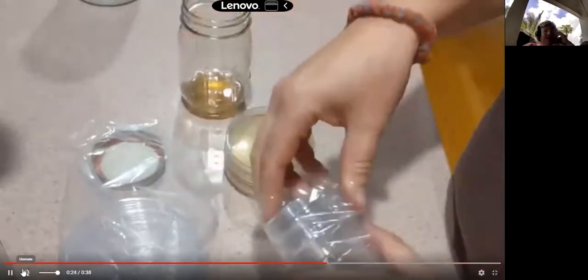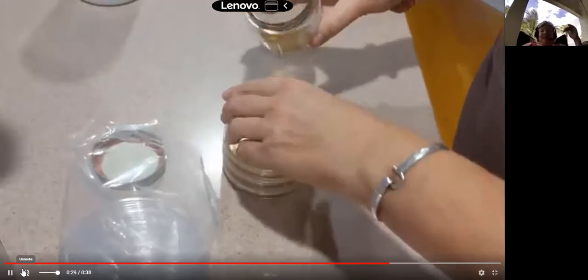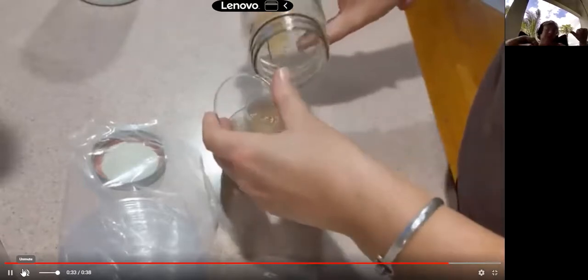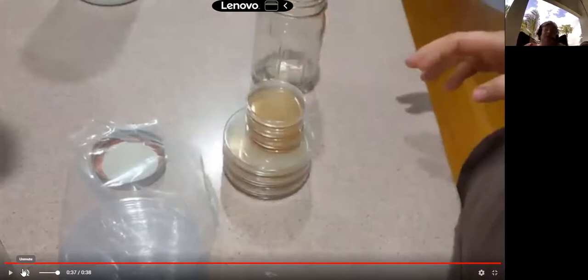And we do this because, frankly, this is a growth media set up to grow yeast. We have yeast in the air. Molds especially love malt extract. And so in addition to yeasts, if you leave agar plates open, you will have a lot of molds.